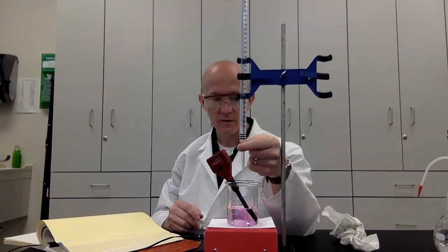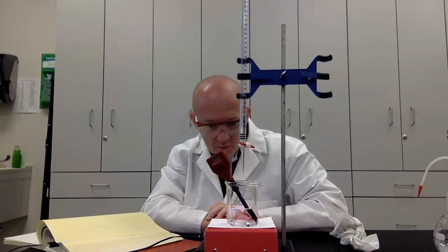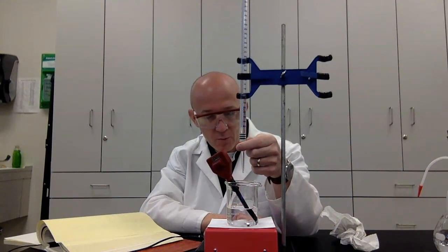Oh boy. Can you see it? That's what we want. That's what we want right there. We want it to be the slightest bit of pink. Pink is the color that we see when phenolphthalein moves into a basic environment. So it's starting to go away just a little bit. I'm going to add one more drop. One little drop.